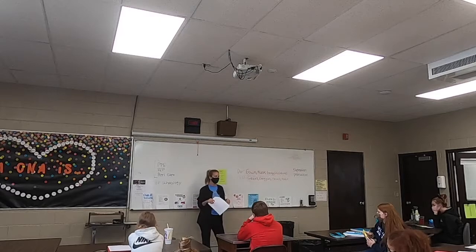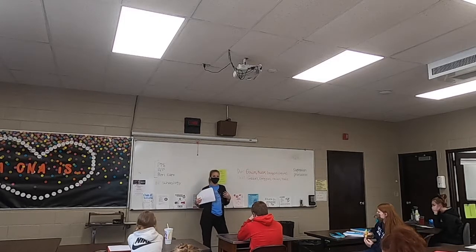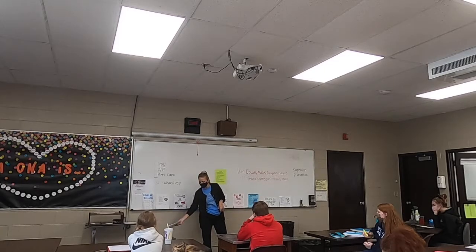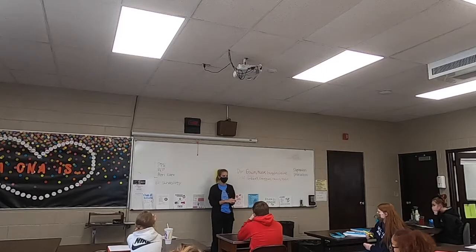The goal when we take it off, which me and Jill will show you, is to not touch what's contaminated. But if you contaminate your hands at any point, wash them immediately. Otherwise, if you take it off properly, you can wash your hands at the end.